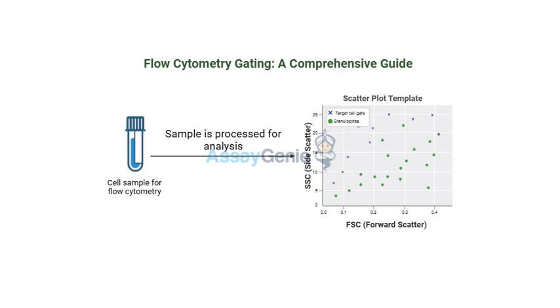So we're not just looking at a jumble of cells anymore. We're starting to identify specific groups and what they do. Exactly. And that's just the beginning. We can use a bunch of antibodies all at the same time to create these detailed profiles of different cell types, and it lets us uncover these really intricate relationships within our cellular world.